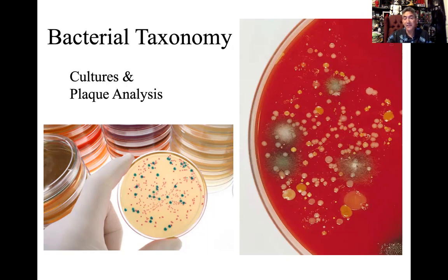So that's a fungus. It would give the doctor or the researcher an idea of what types of things they're dealing with, right? So it's an important first process, the first part of the analysis, the first part of determining the species or type of bacteria that we're working with. The plates, the culturing, the incubation, and then the plaque analysis, right?